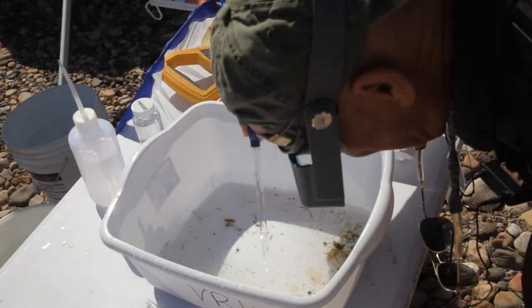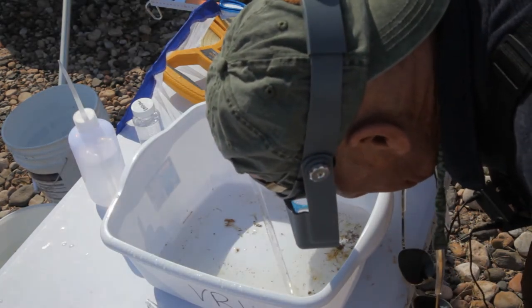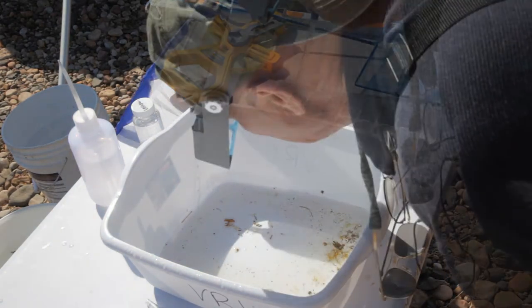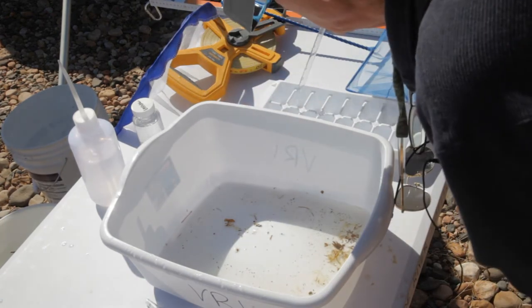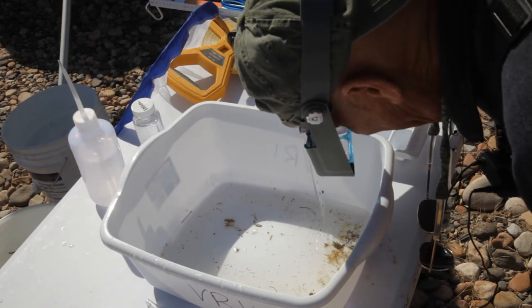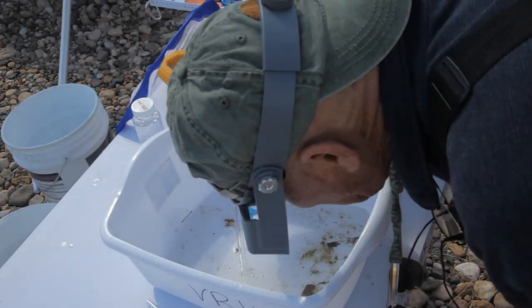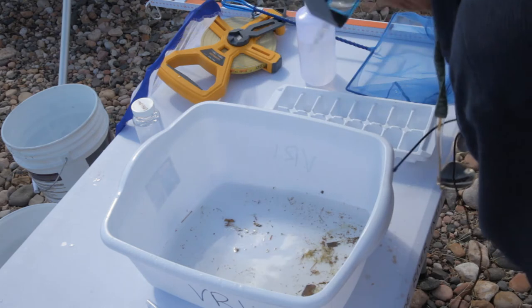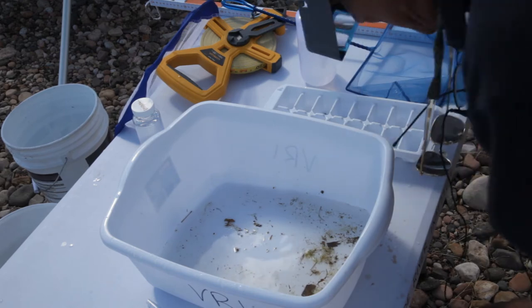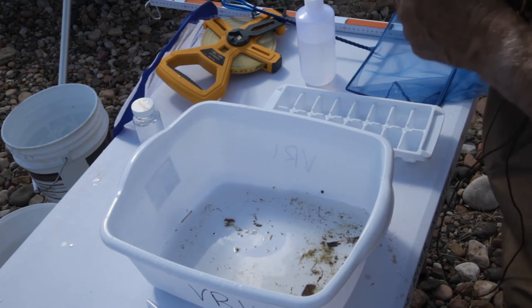We're almost done grabbing everything we can grab out of here — a few little bitty guys, some mayflies. Indications are really good here: we don't have many of those species that indicate poor water quality, and we have a lot of species that indicate good water quality. There's another little black beetle. We're going to reserve one of the cubicles in the ice cube tray for just unidentifieds — things we're not quite sure of.